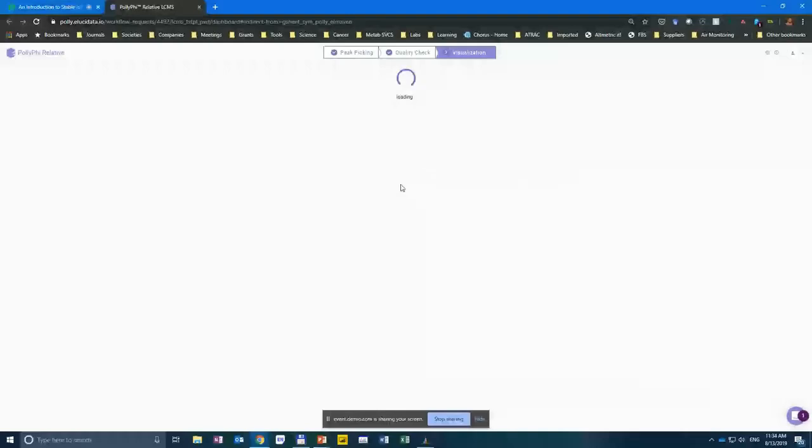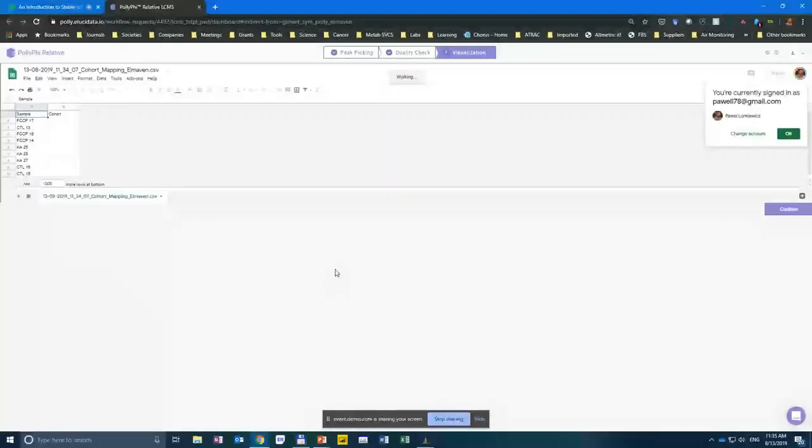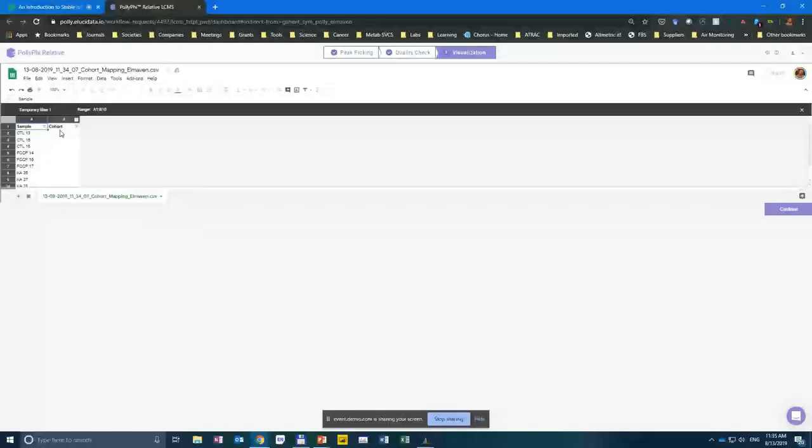and loads our data. I don't have my email application open, but we actually receive an email once this is uploaded to Poly, and that email contains a link that we can always revisit. So that's a very good feature, because we can go back to this data and re-edit it again at our convenience. So this opens an Excel spreadsheet and that's in Google Sheets. And this lets us define our cohorts. So I'm just going to quickly assign some abbreviations for our cohorts.